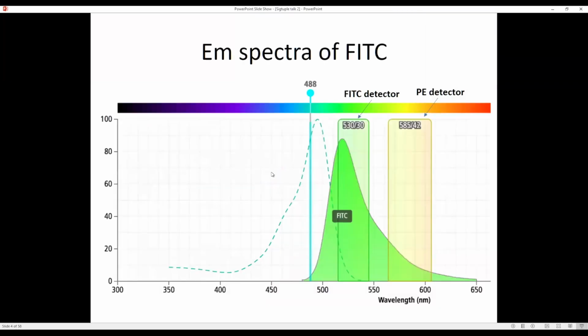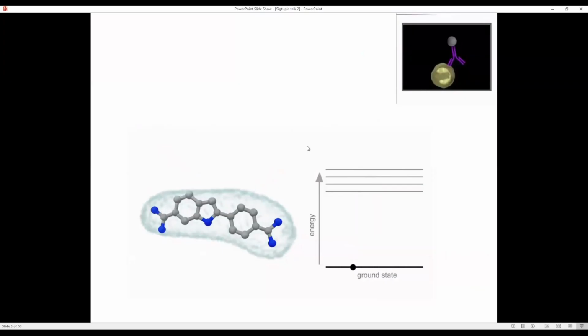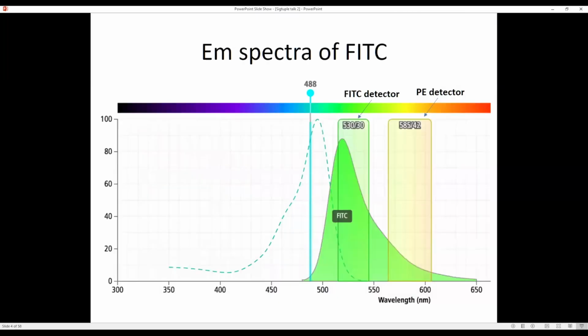Now, when we talk about this emission of light, it absorbs light from the laser, which is monochromatic. I repeat, it absorbs light from the laser, which is monochromatic, a single wavelength light, and emits light at a different wavelength, okay, especially a longer wavelength and lower energy. Now, this emitted light, you need to remember, is not monochromatic like the incident light, right? It is a spectrum.